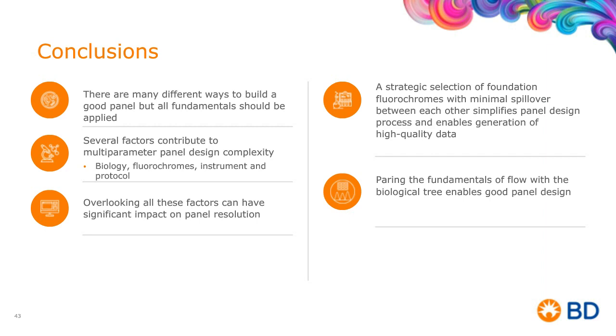Most of these fundamentals that I've talked about today, though, have everything to do with an analytical panel. Because at the end of the day, on a sorting panel, if you don't port that analytical one over to a sorter, it's just about isolating that one population or two or six that you need, and you might go about the panel design in a little different way. But it's all about what you're trying to achieve.